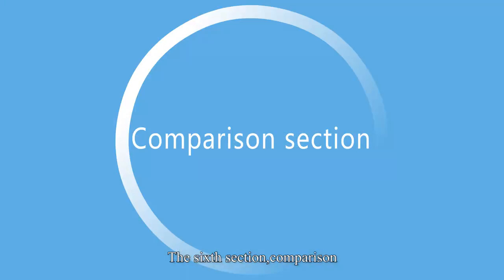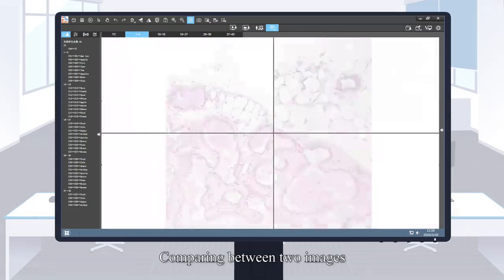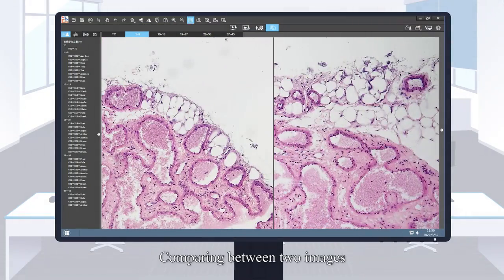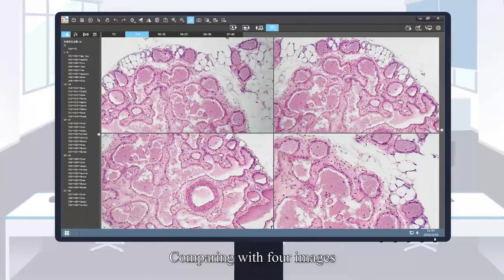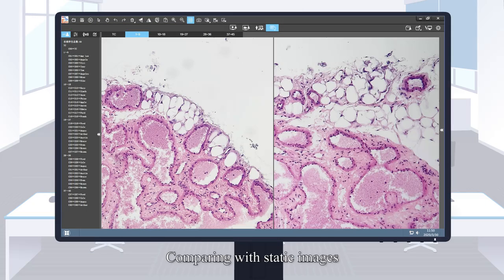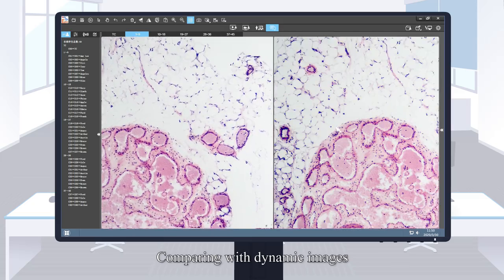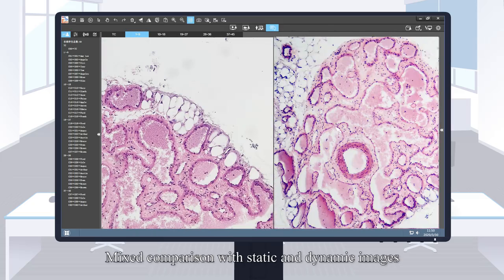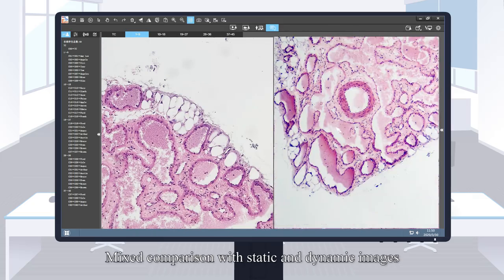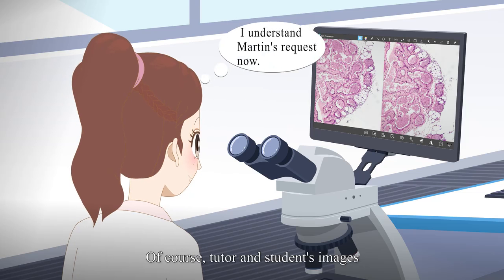The sixth section, comparison. Comparing between two images, comparing with four images, comparing with static images, comparing with dynamic images, mixed comparison with static and dynamic images. Of course, tutor and student's images can also be compared with each other.